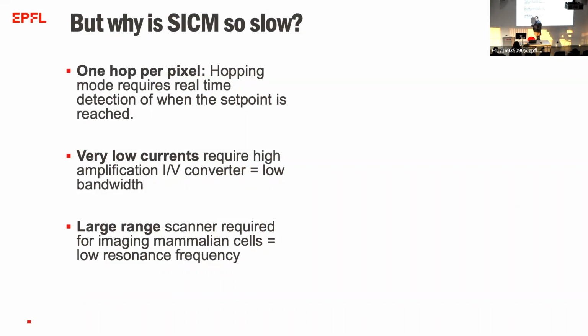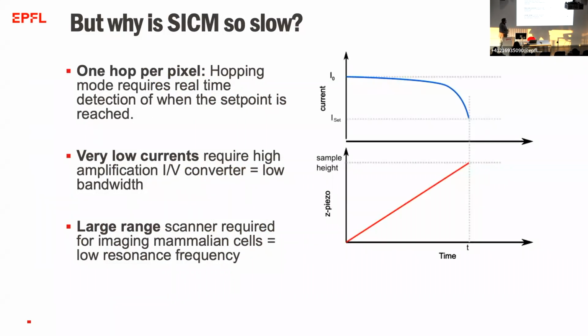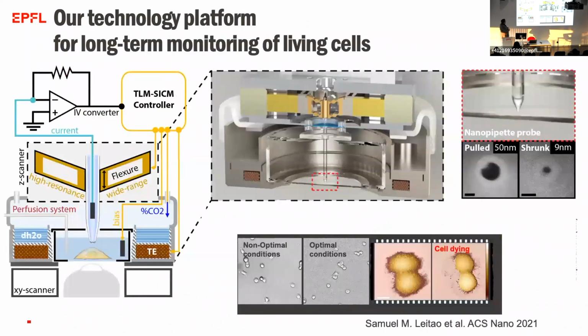So we could apply a lot of the things that we had learned from high-speed AFM also to this. Unfortunately, here we could not do the trick with making custom cantilevers and lasers and things like we had before. Here, we actually had to come up with a few new things. Just to cut a long story short, there was a lot of development in many areas in terms of mechanics.